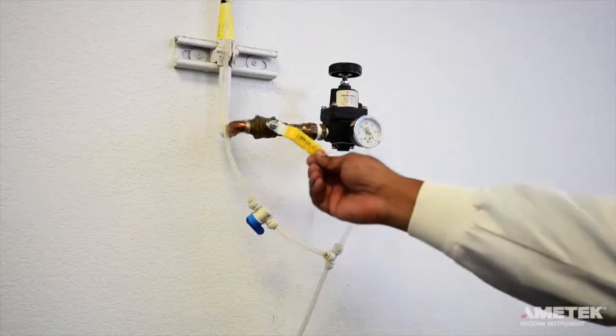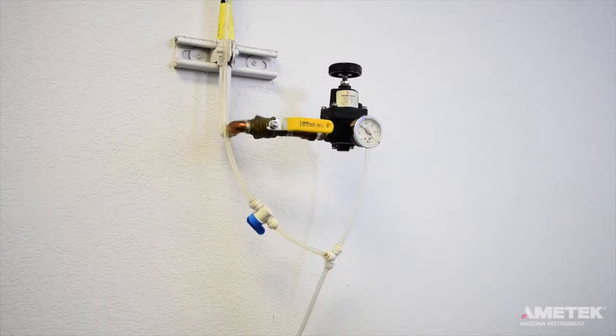For both of these options, be sure to adjust the pressure to the instrument so that it is between 17 and 22 psi, with 20 psi being the preferred pressure. If you are using a compressed gas cylinder, a two-stage regulator is recommended.